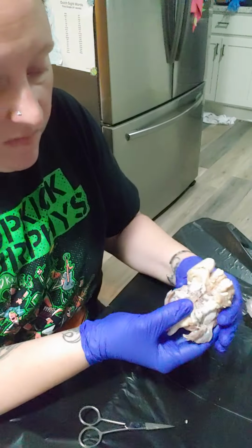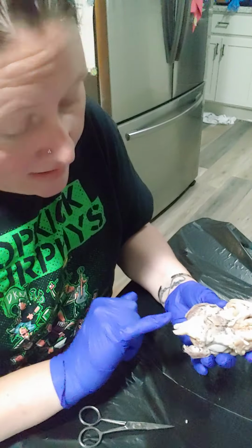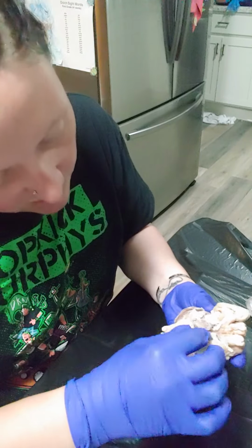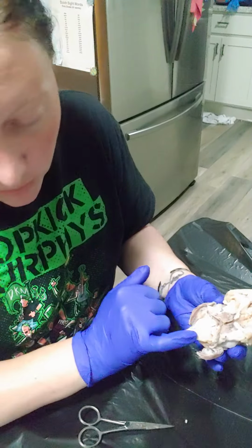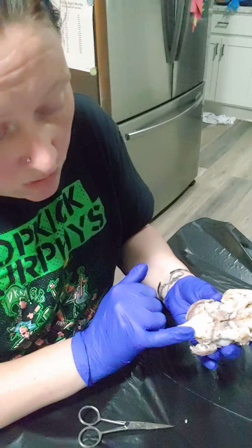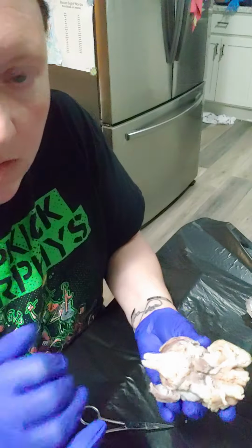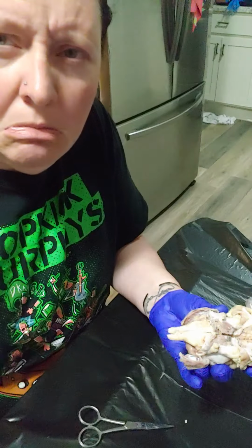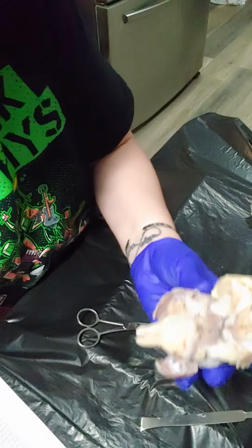Flipping over. It's so ugly. This again is your brainstem. Following it up, there's typically, maybe I can see it. Okay. So this first lump or bulge right here is going to be your medulla oblongata. And I don't think you can see anything with this glare. I don't know if I can touch the camera to bring it down. I don't think that helped.